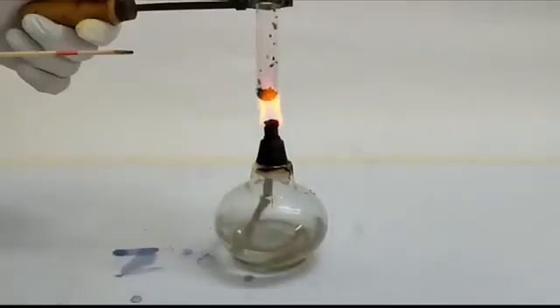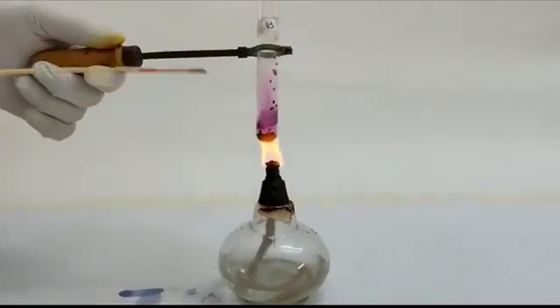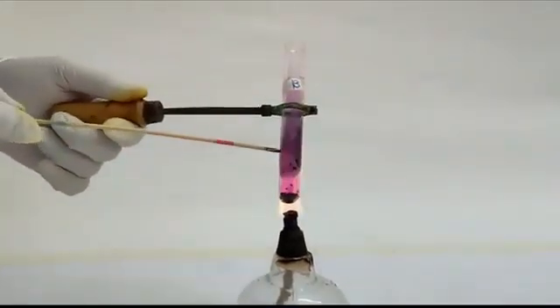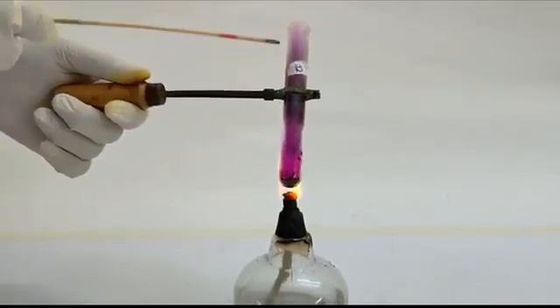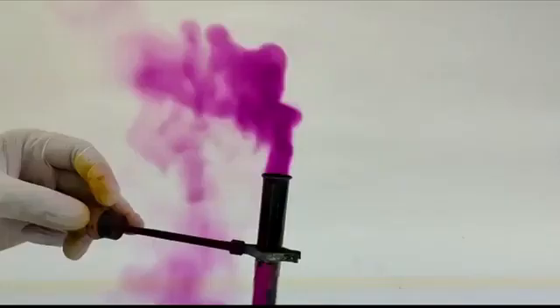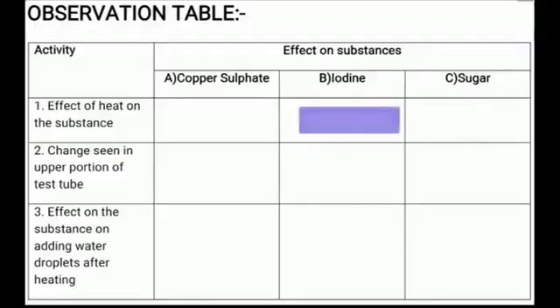In this activity B, let's heat Iodine given in test tube B. Observe the effect of heat and note down the observation in the given table.